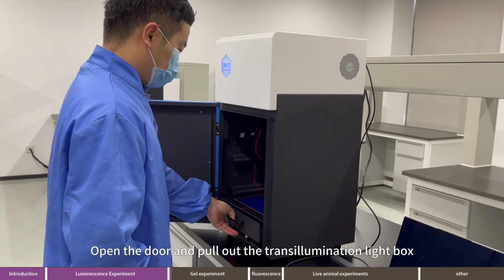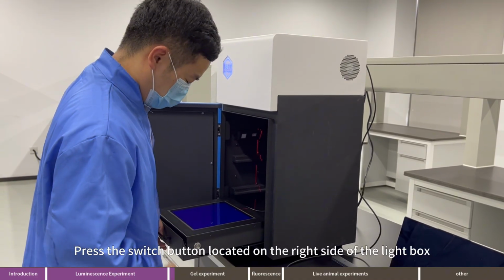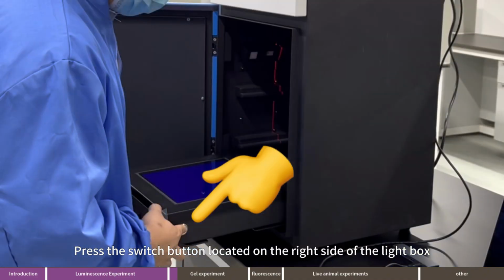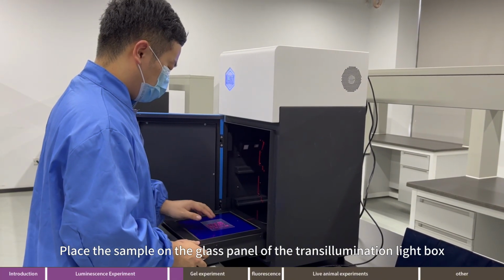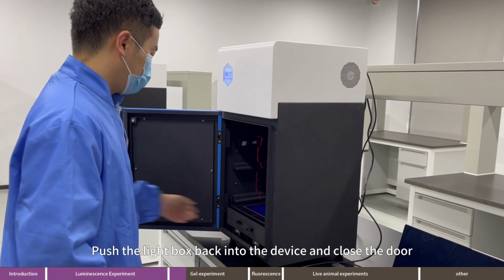Open the door and pull out the transillumination light box. Press the switch button located on the right side of the light box. Place the sample on the glass panel of the transillumination light box. Push the light box back into the device and close the door.